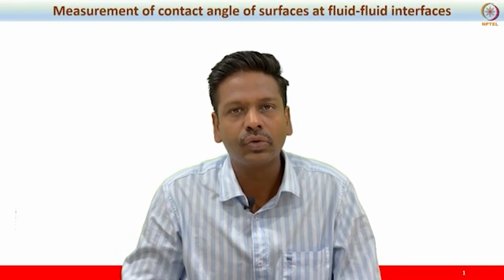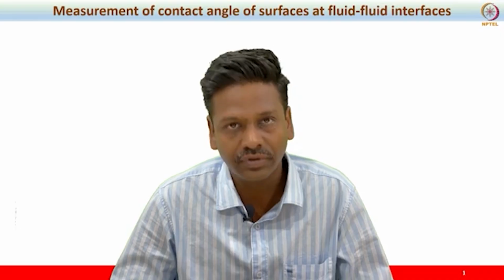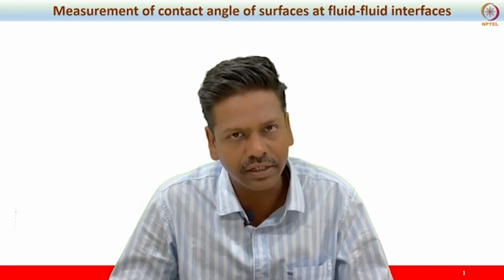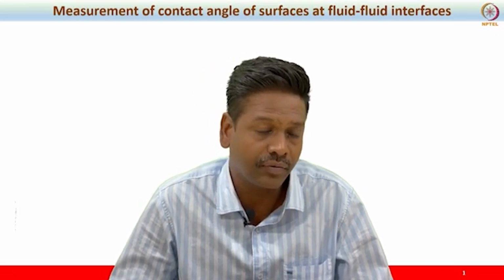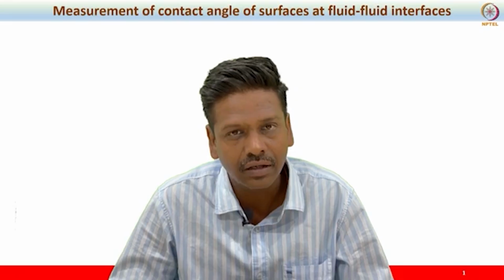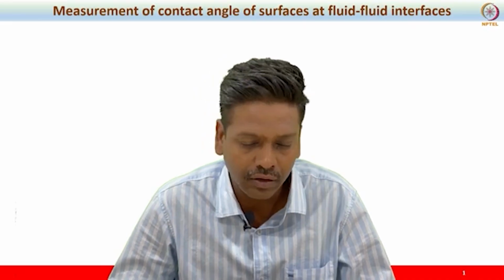Welcome back. So in today's video lecture, we will look at the measurement of contact angle of surfaces at fluid-fluid interfaces. So far we looked at various measurement techniques. Let's say we have looked at the sessile drop method, wherein if you place a drop of liquid on the surface, can we measure the three-phase contact angle using the Young-Dupré equation? So these things we addressed so far.